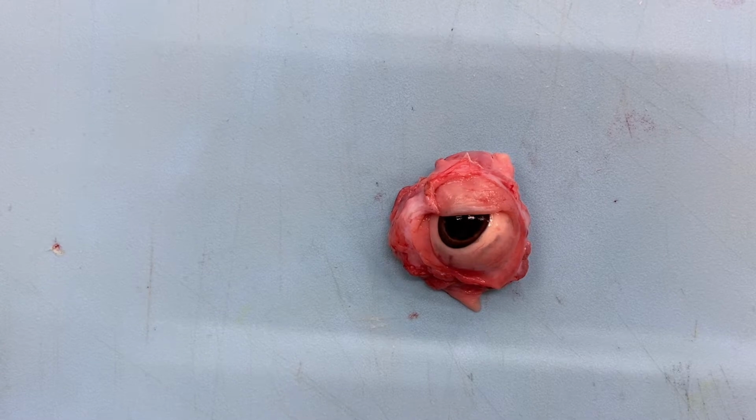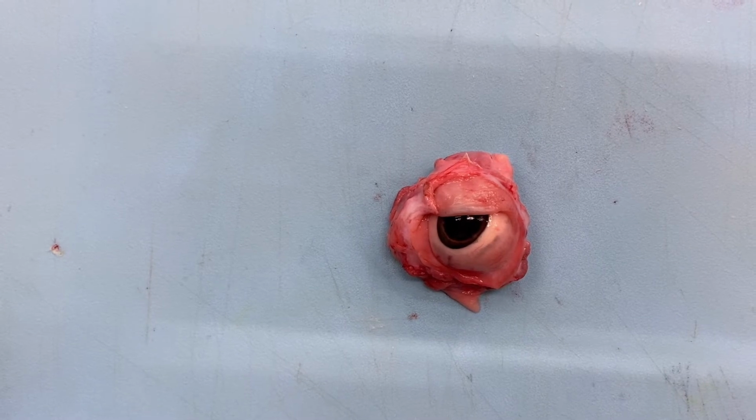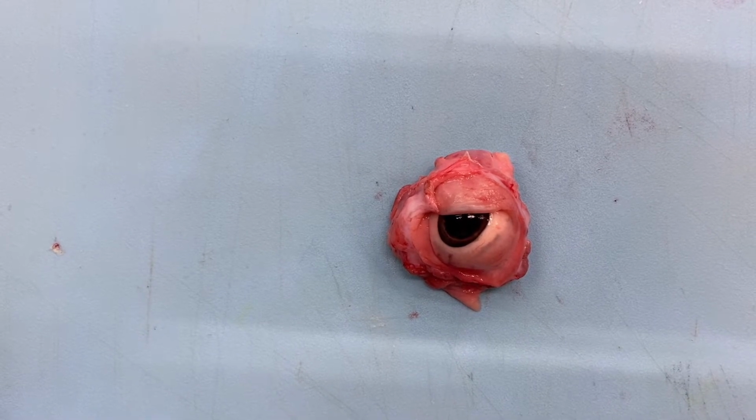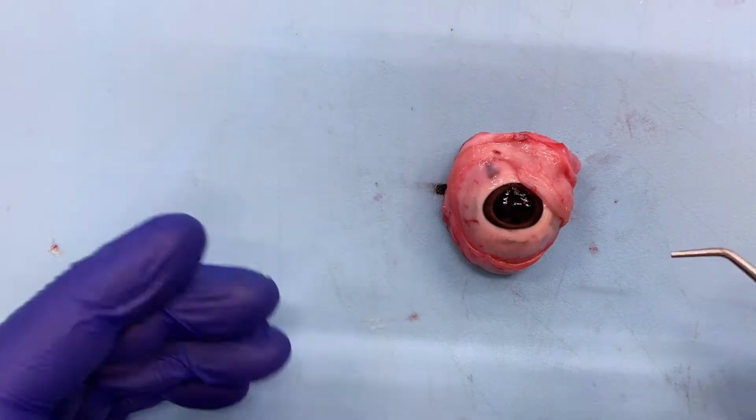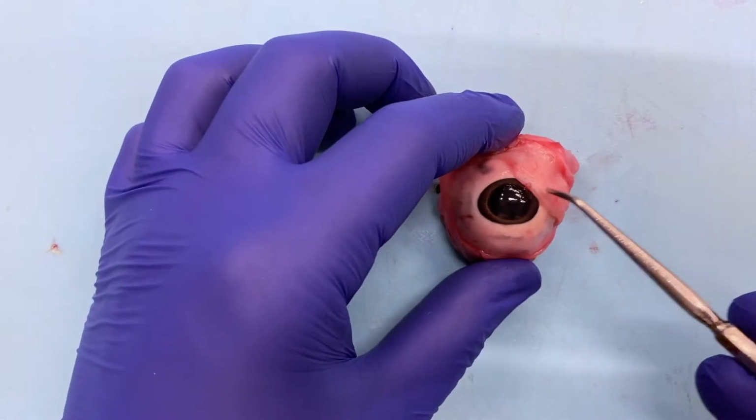So today's video will be going over the basic anatomy and prosection of an enucleation specimen. Now the specimen I have before me actually contains a little bit extra soft tissue and isn't a true enucleation specimen. So the first thing we notice externally is the eyelid here.